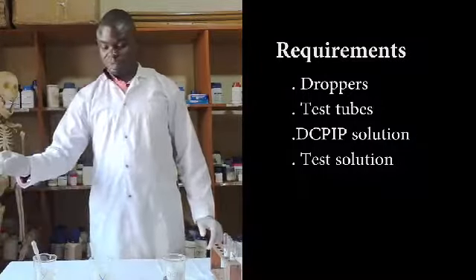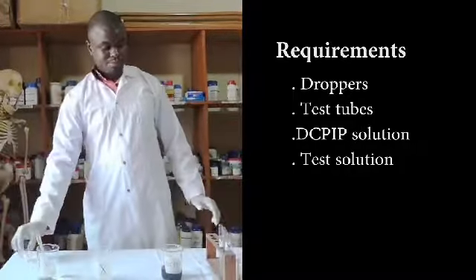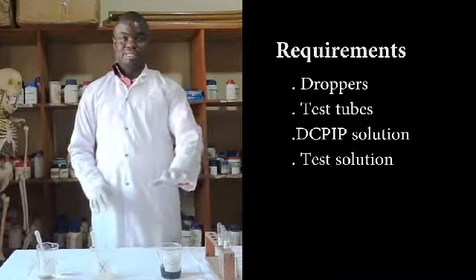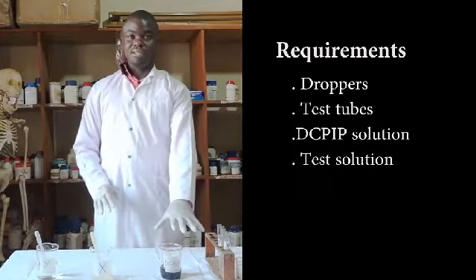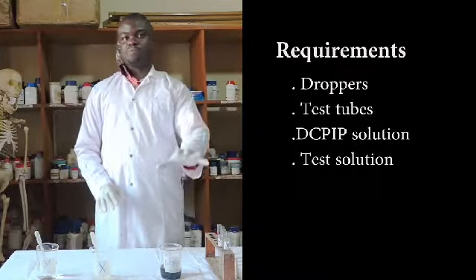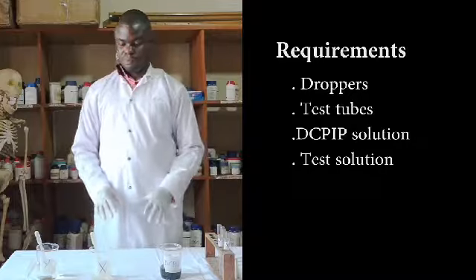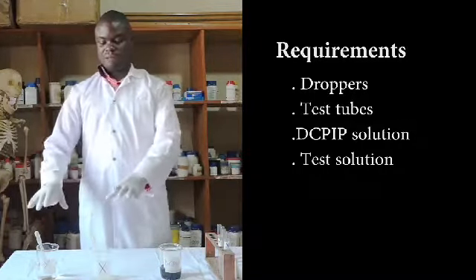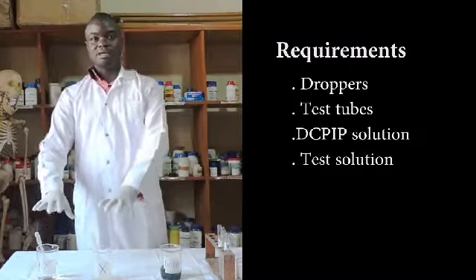So what are the requirements? We need droppers and I have some here. We need test tubes. We need DCPIP and that is dichlorophenol. We need the test solution. And here I have got two solutions that is X and Y.